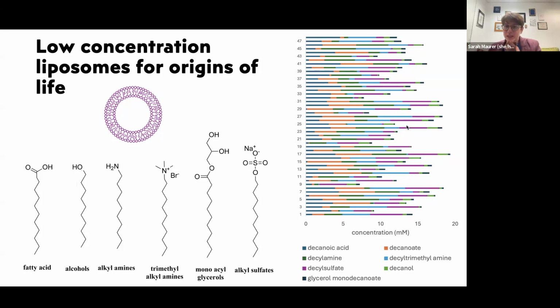Okay, so the next question is, could you elaborate a little on the workflow? Were vesicles, liposomes formed in just one rehydration cycle, no extrusion? With the image analysis, were you looking for vesicles of a certain size? That's a really good question.